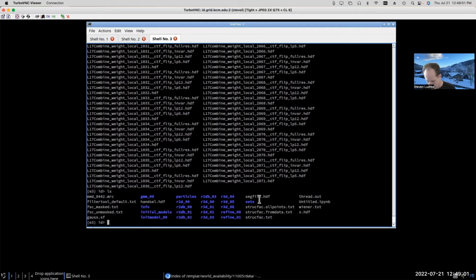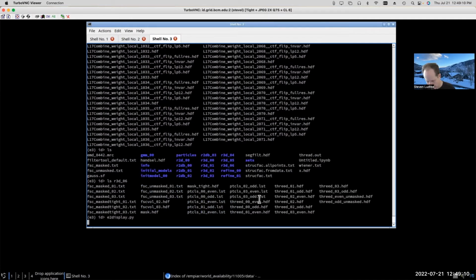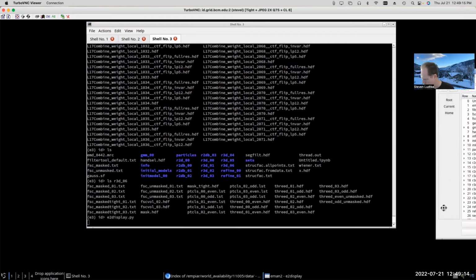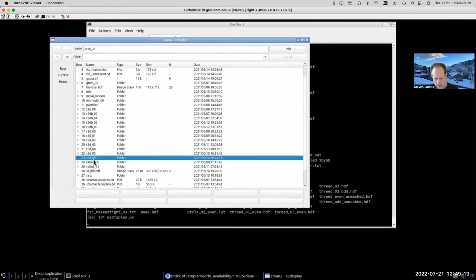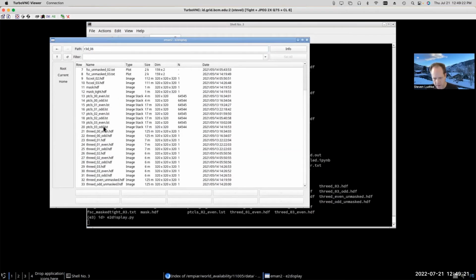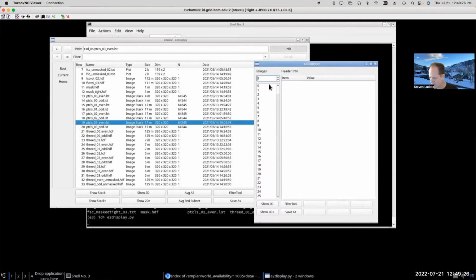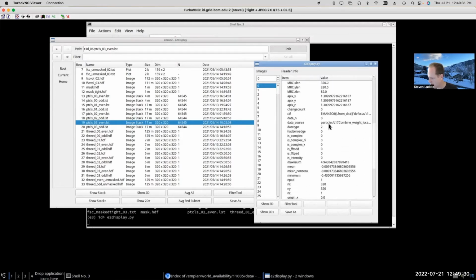little project. Again, if we look at the R3D06 folder, at the LST files there, now if we do an e2display, oops. It's kind of irritating. Yeah. And we look at the LST file info. You can see the LST file is referencing particles from a variety of different images.